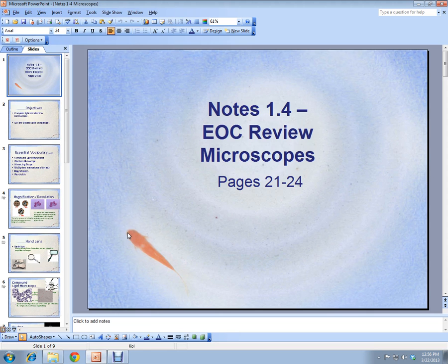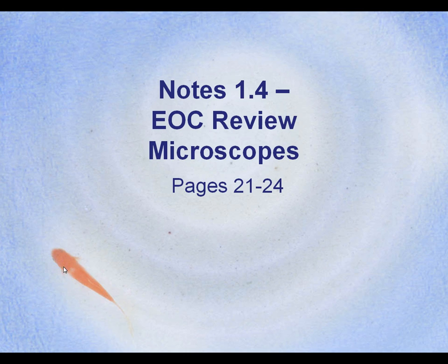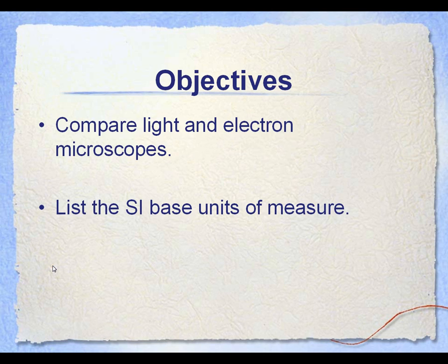All right, the last installment for Chapter 1, which is very important, are the microscopes. There are always questions about the microscope, so let's review these. The light and electron microscopes, they like to trick you up as far as which one would be best to do this.